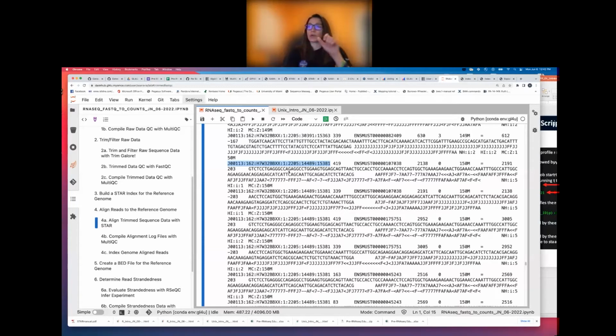And then it's looking at the orientation. So it does a template length first; we told it that it's paired end here because we gave it a forward and a reverse read. And so the tool knows that this is paired end. So with any read, it's always looking for its mate pair to determine what the template length is. And then based on the orientation, it's just looking at how this sequence maps back to the reference, and if it's going to be in the same orientation as the reference, or if it maps back to the reverse complement orientation of the reference.